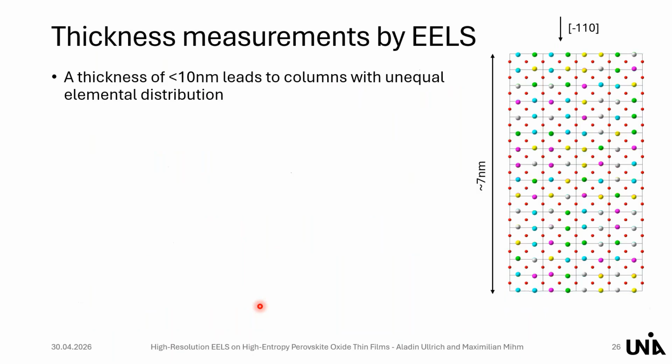So let's go on with this value, again to some structure. I made a model of our sample with the specific structure we expect, with a thickness of about 7 nanometers, and I filled it randomly with 5 different atoms, indicated here by 5 different colors, in between the manganese host lattice given by the red atoms. We have a viewing direction, in our case, of the -110. So that means we get approximately this arrangement of atoms here.